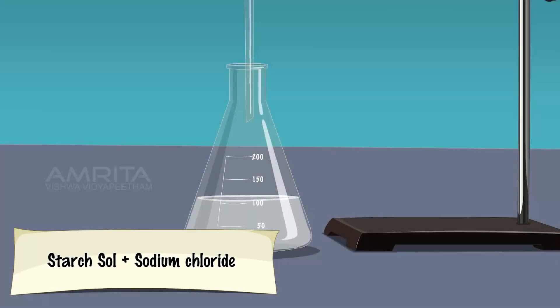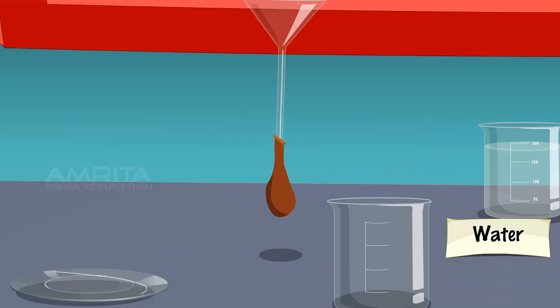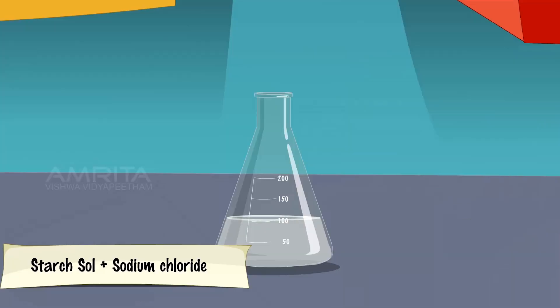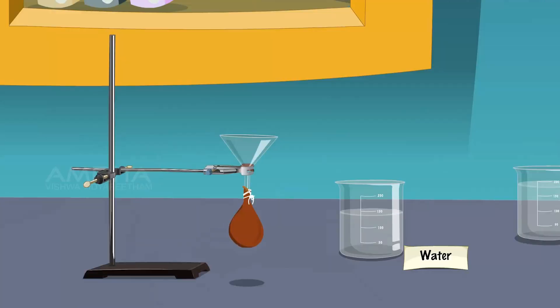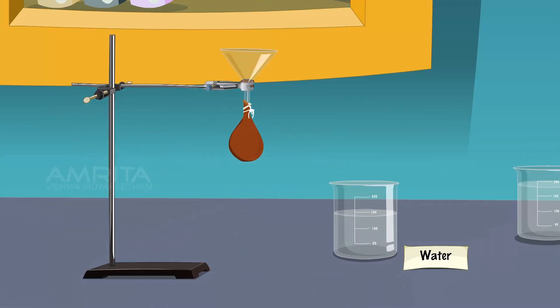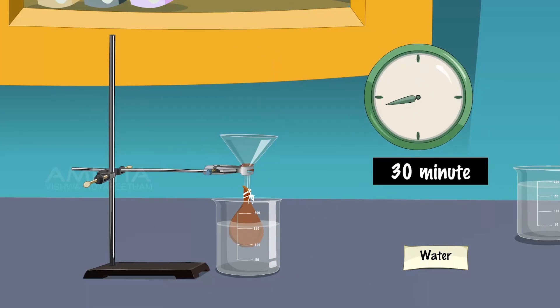Take the starch sol containing sodium chloride in a conical flask. Take a funnel and fix a parchment membrane to the stem of the funnel. Tie the membrane to the stem of the funnel using thread. Pour the starch sol containing sodium chloride into the funnel until two-thirds of the parchment bag is full. Dip the parchment bag into distilled water taken in a beaker and fix the funnel in position by means of the clamp. Allow this to stand for about half an hour.